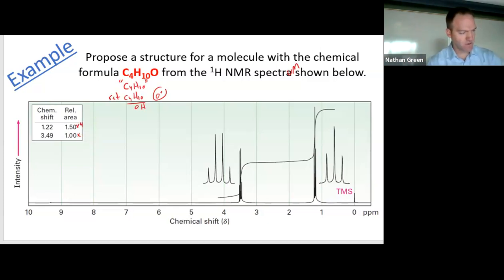1.5 times 4 is 6 protons. 1 times 4 is 4 protons, which means 10 protons total. My signal at 1.2, that's this guy, is worth 6 protons. My signal at 3.49, that's this guy, is worth 4 protons.